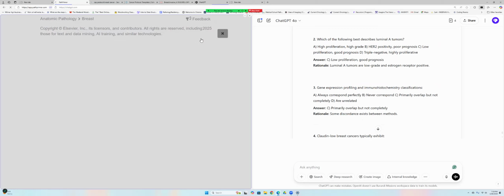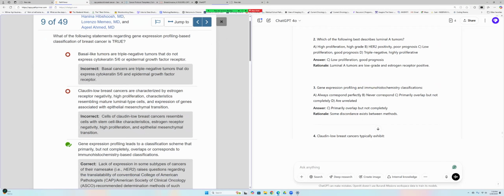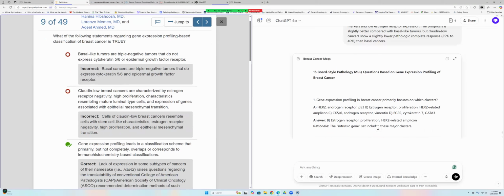What do you use to take the pictures? We have special cameras in the grossing room, very good cameras. It's like a camera station, the way you have a grossing station. You just put the specimen under, take the photograph, and of course you put in the accession number. It will automatically upload the photograph into the patient's anatomic pathology laboratory information system. You don't use paper, you use the laboratory information system.